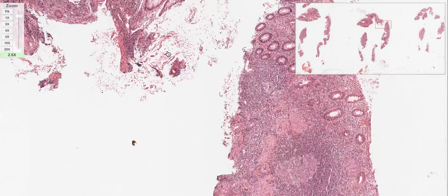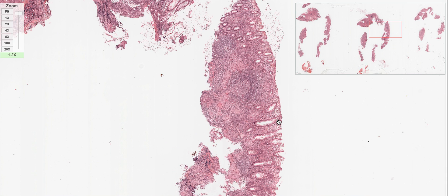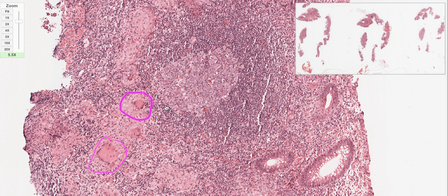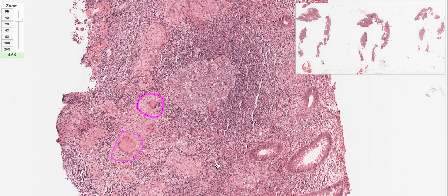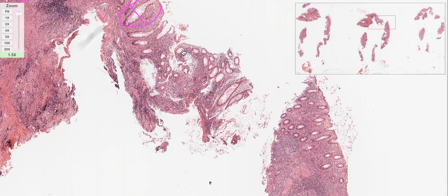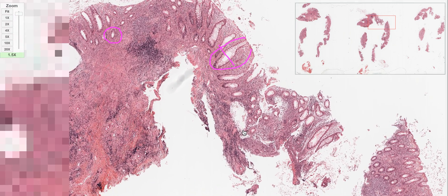Moving to the next piece of intestine: the crypt architecture is distorted, and you can see something pale surrounded by a dark region at low power. Zooming in, I see a central pink area surrounded by inflammatory cells - small round blue cells, lymphocytes - and giant cells. This is granuloma formation. Anywhere you see a granuloma, the first thought is tuberculosis. So I have granuloma formation and cryptitis - two findings so far.